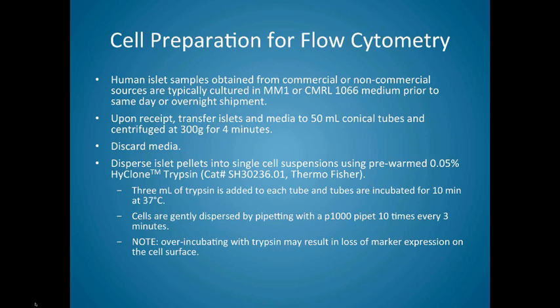I'm emphasizing this because this is the enzyme we use for these dissociations, and one could see different results if, for example, a different source of enzyme or a different type of enzyme is used, or if that enzyme is left on the cells for a longer period of time, you might actually lose expression of the markers that you're trying to detect with the different reagents.